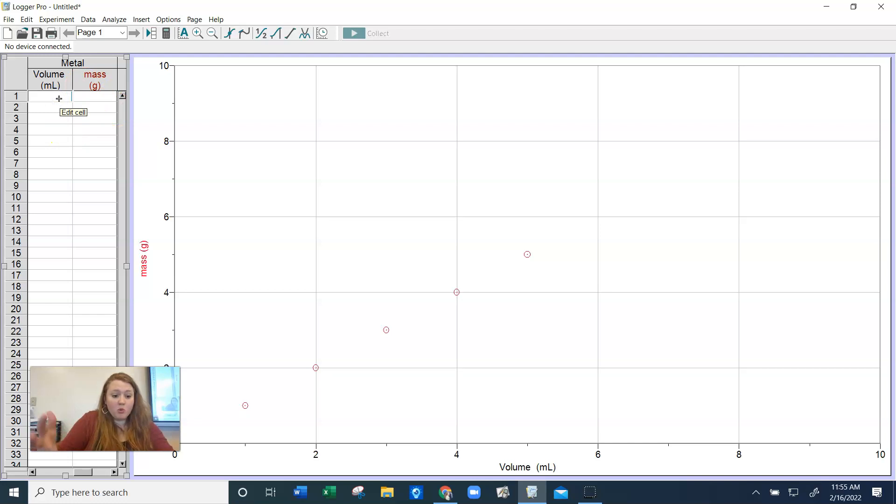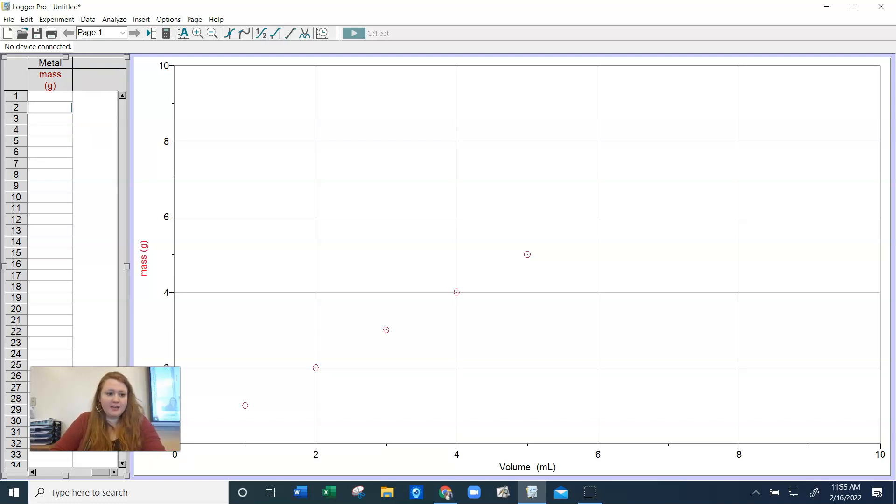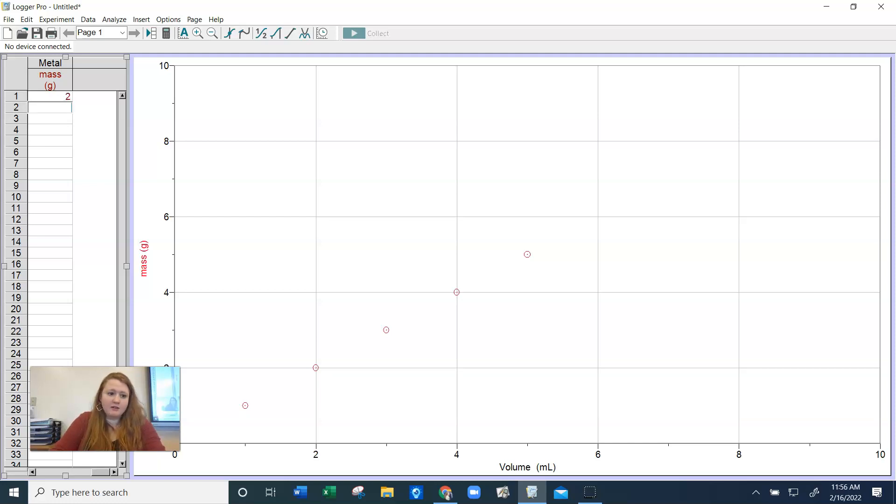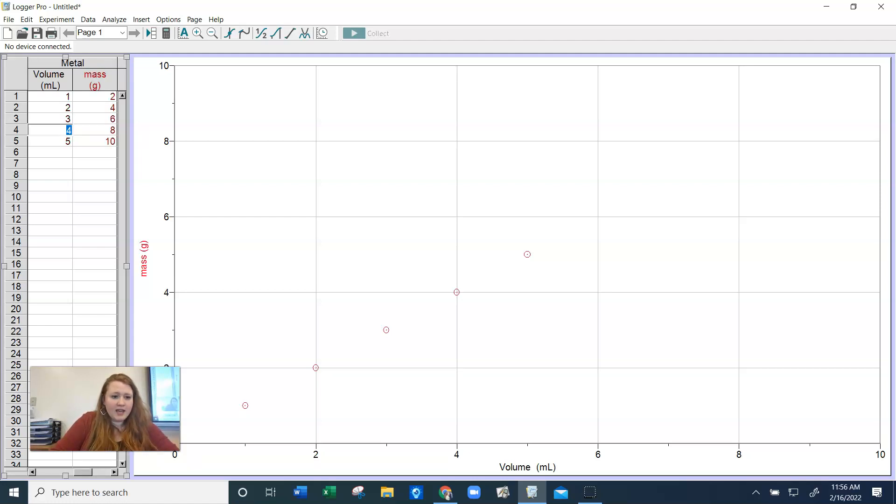So now I'm going to do more bogus data. Let's see. And you'll notice I'm just putting in the numbers. Now, if you click enter, it's going to take you to the right. So I'm using the arrow keys to put in my data. I'm going to tap in two, press the down arrow, and then four. Remember, your data is going to look a little different. So now we have all of our columns. We have the non-metal mass and volume, and we have the metal mass and volume.